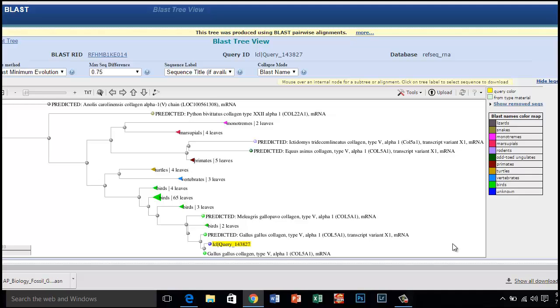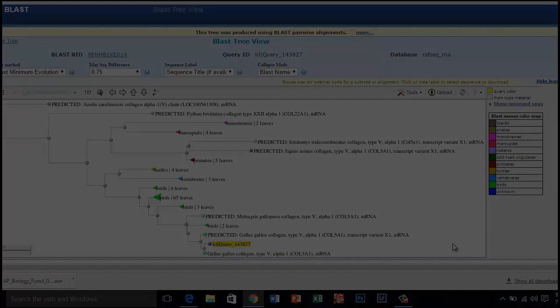After collecting and analyzing all the data for that particular gene, repeat this procedure for the other three gene sequences.